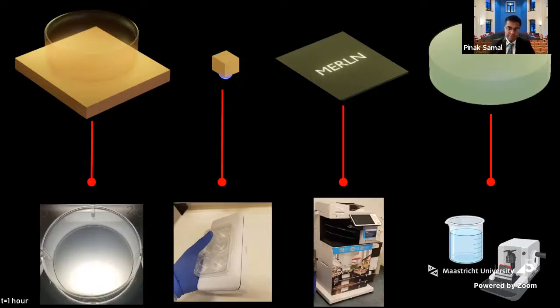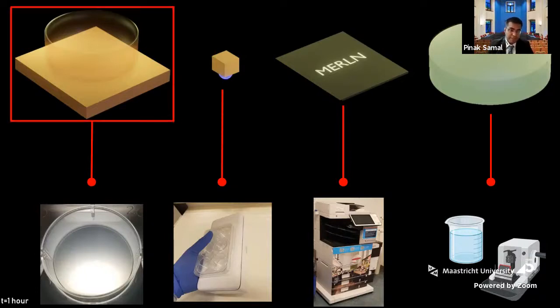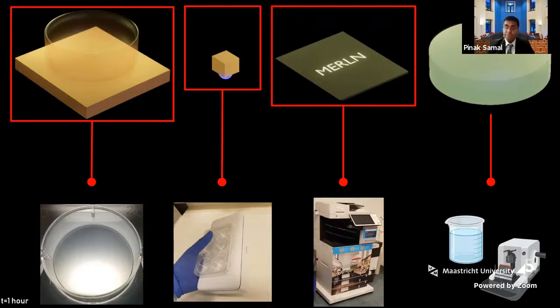So we use the same polystyrene well plate as shown. We use a commercially available deep UV exposure device, which is widely available nowadays for sterilization of mobile phones and use in households. Instead of a chromium quartz mask, we now use a printer-based mask. So you can literally print your mask on paper. And for all this process, we use the same developer.